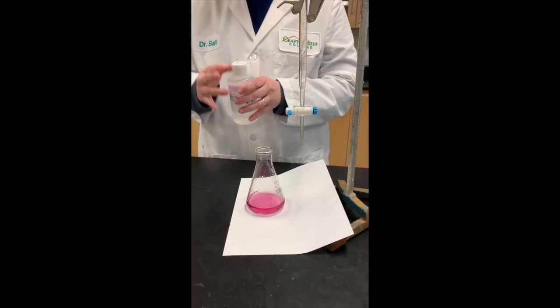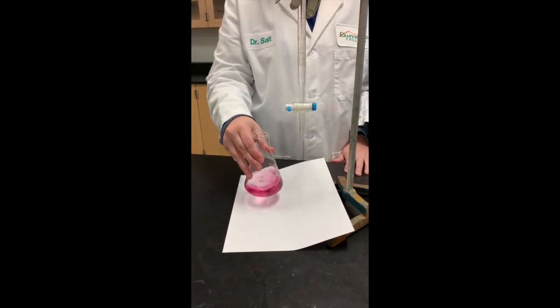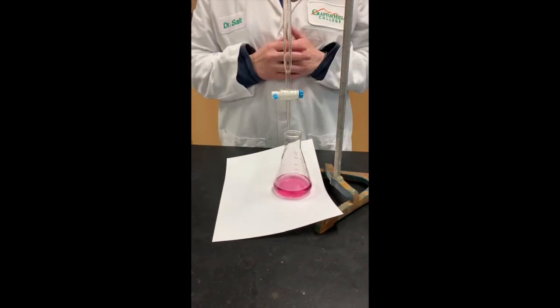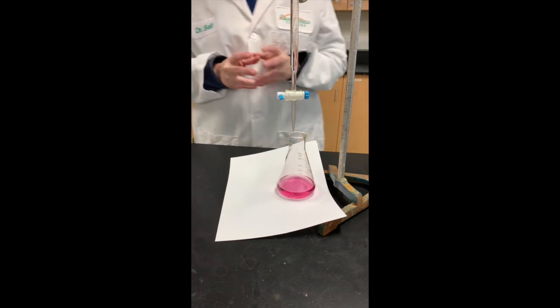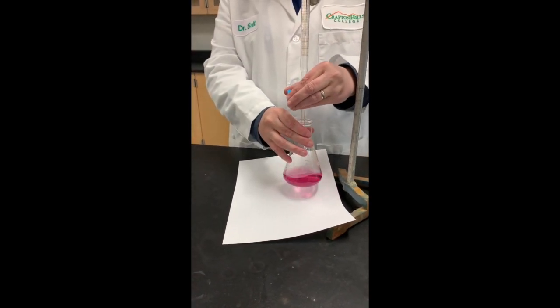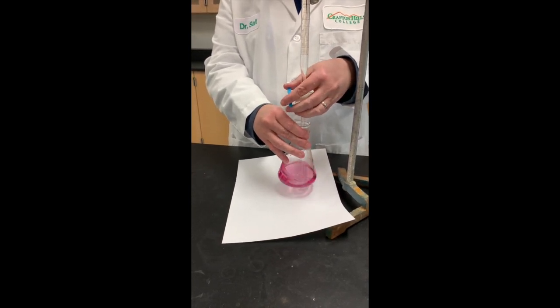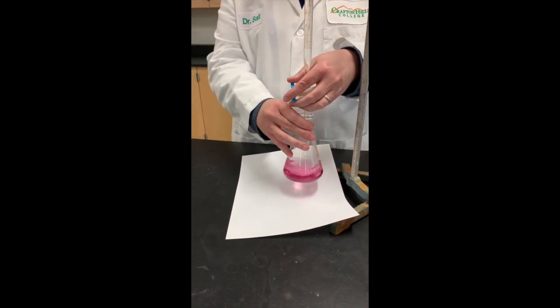Now, if you get too much magnesium chloride, it's not a big deal. Magnesium chloride's there just to make the endpoint a little bit sharper. It's not critical the exact amount. So in this titration, we're starting at 0.01 milliliters for our initial volume, and we're going to add. Now, the water samples don't tend to have a large amount of calcium in them, so don't go too fast on your first trial, because you may not use as much as you think.